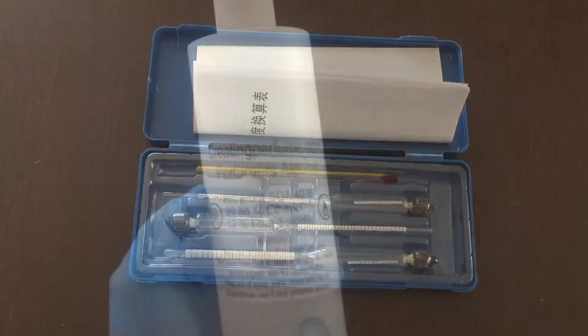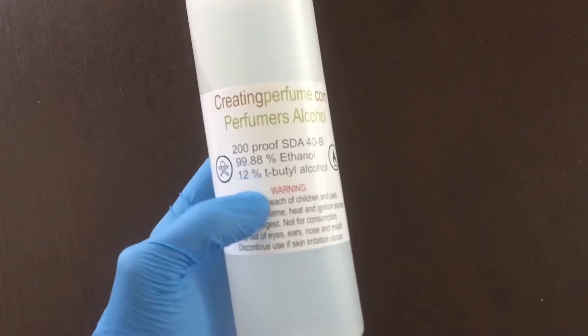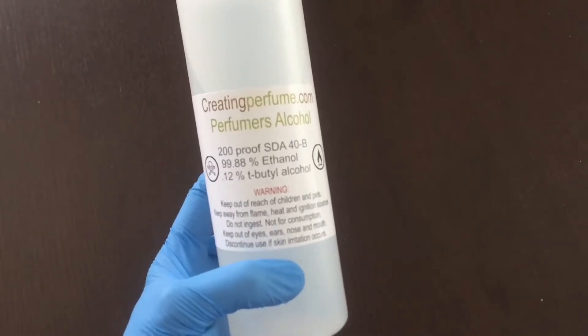These hydrometers seem to be handmade and as the first one and the third one have little slips of paper in it, at first I thought that they wouldn't work. However, they do seem to be accurate.